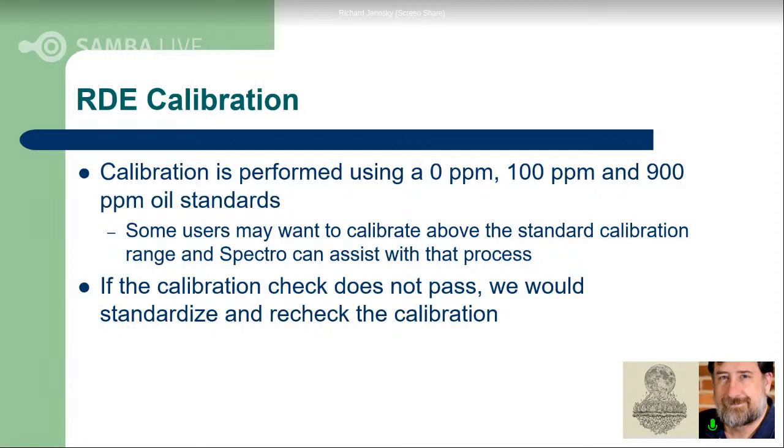Grease will accumulate these wear particles over time. So it's quite common that we get samples with thousands or even tens of thousands or even hundreds of thousands of ppm. And so in that kind of situation, it's worth considering, should we create a different kind of calibration span here that helps us better report these higher values?